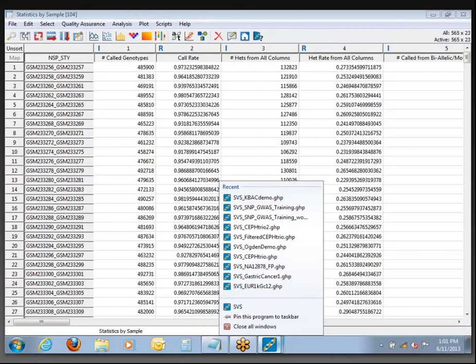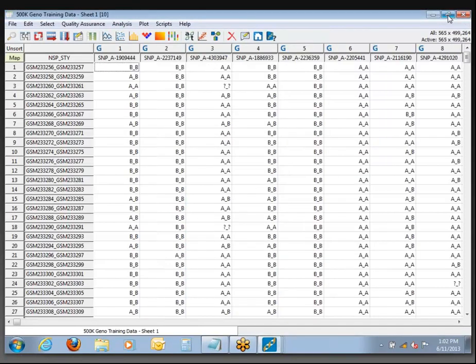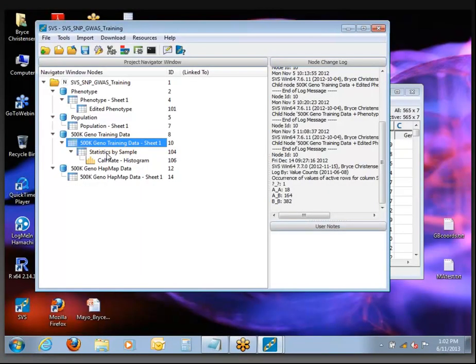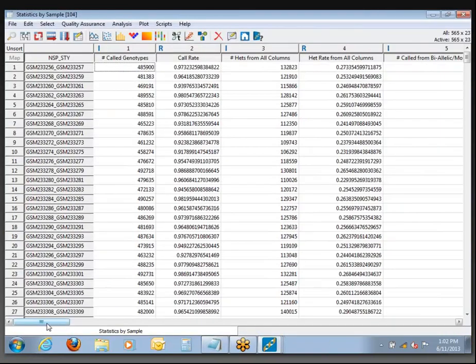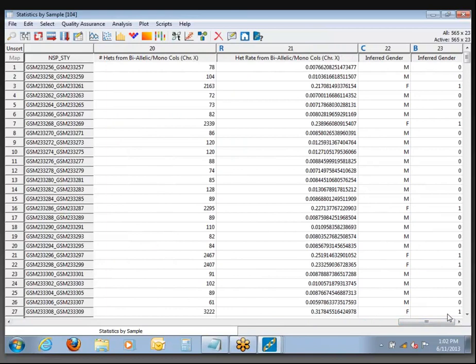Let's go ahead and turn the page and come over to the genotype gender check. We already ran this — this particular document was written before the current sample statistics dialog was created. It used to be that the genotype gender check was a separate function, but since we have Statistics by Sample output, we go back to that original output spreadsheet. Out here at the far right we have this heterozygosity rate specific to chromosome X, and this inferred gender column.